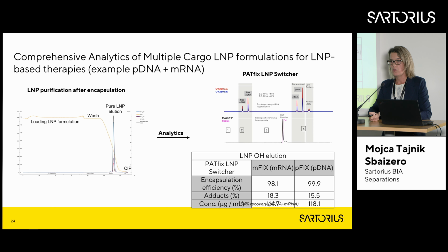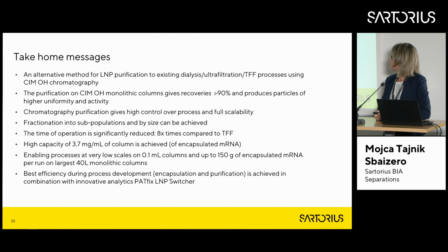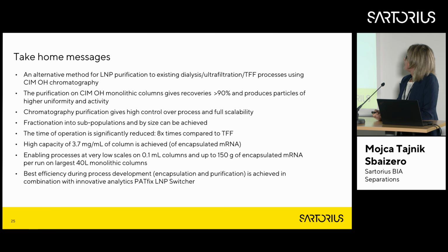So this is an example of how it's very good to integrate analytics already in the process development, and then later in the manufacturing stage. It will really help to speed up the process and to deliver better products. I will slowly conclude with take-home messages. We are showing an alternative to the TFF purification. We use monolithic chromatography, and hydrophobic interaction is the current choice from our side, our recommendation.